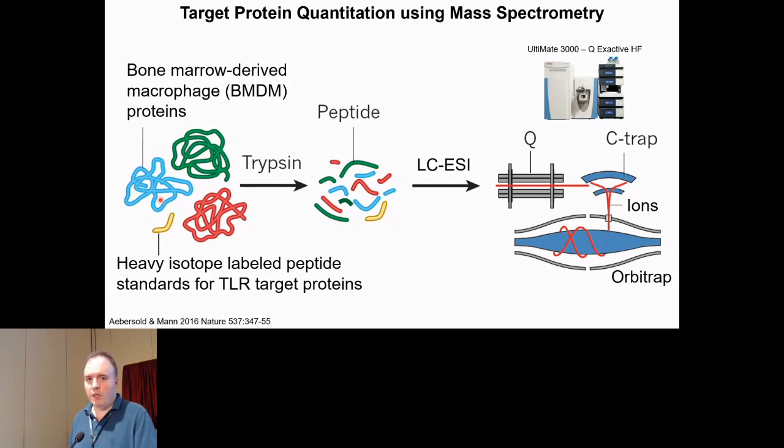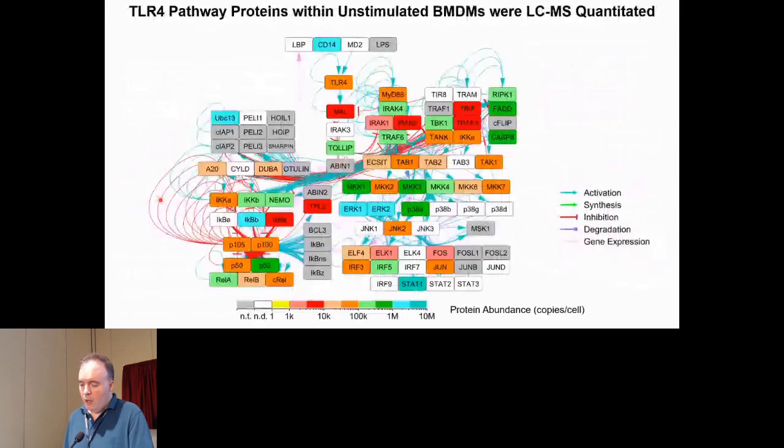We developed two peptides per protein, so we get two independent measurements. If they disagree, that's because we probably were unaware of some splicing or a PTM or a chemical artifact. And what we do is we develop a third or fourth or so on peptide assay to figure out what's really going on. So we've done 2 rounds of peptide assay development. We're in the middle of a 3rd round. Here's what we have so far.